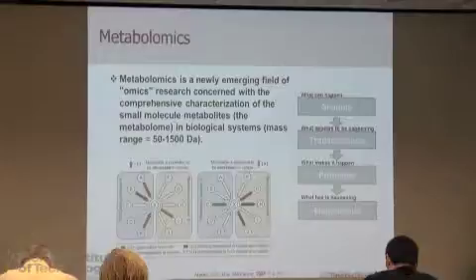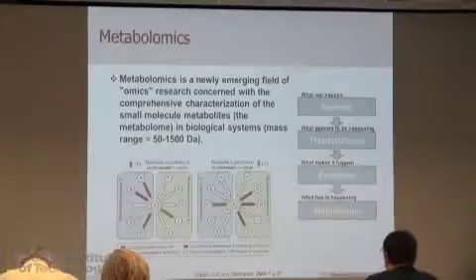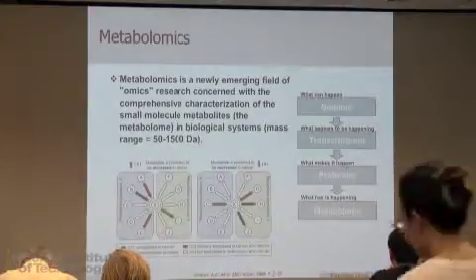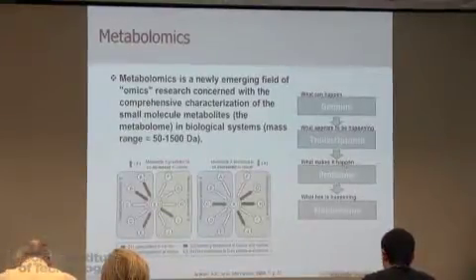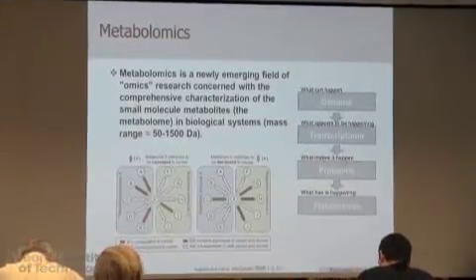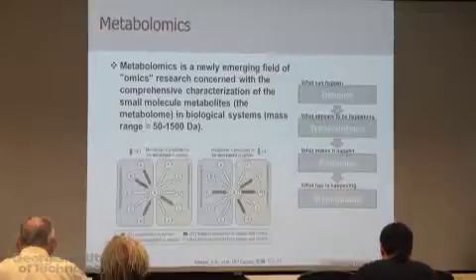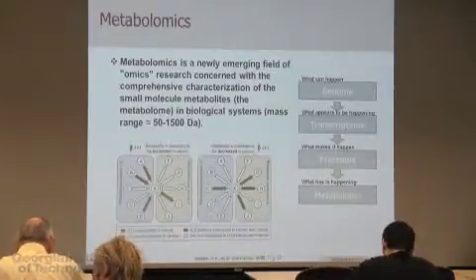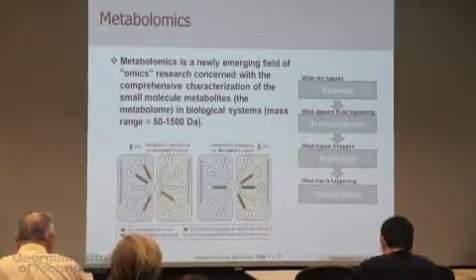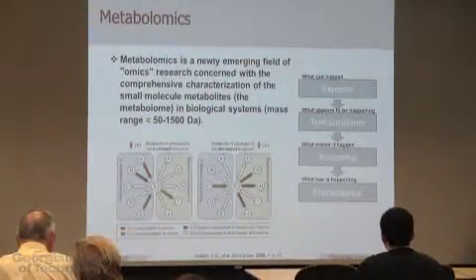Okay, so then came proteomics, which was really enabled by high throughput mass spectrometry and soft ionization mass spectrometers in the 90s. It's a very sophisticated, very complex set of tools, but it's doable and it's relatively routine depending on the experiment that you want to do. Some experiments are routine, some are much more complex. Metabolomics came after that, and I'm going to venture to say that it's moving faster than proteomics, because the tools for metabolomics are similar to the tools in proteomics, with the exception of the bioinformatics part. The bioinformatics part in metabolomics is still where proteomics was 15 years ago. So it's still up in the air, lots of things changing, different groups coming up with different tools, and so on.